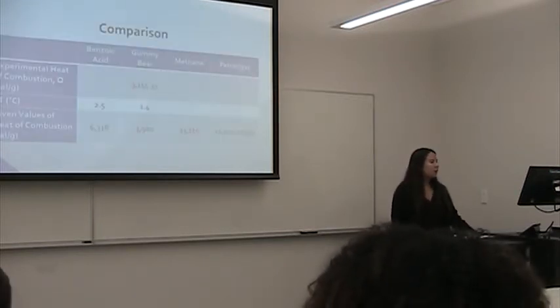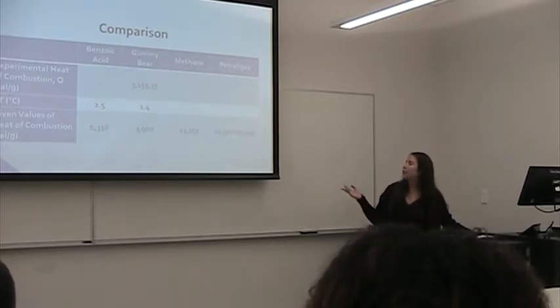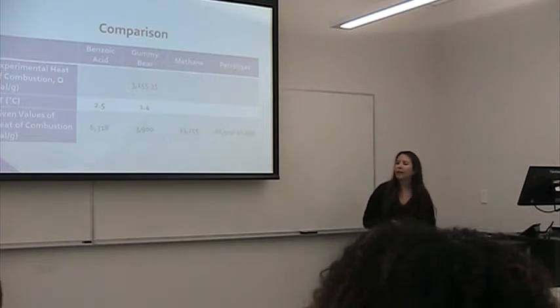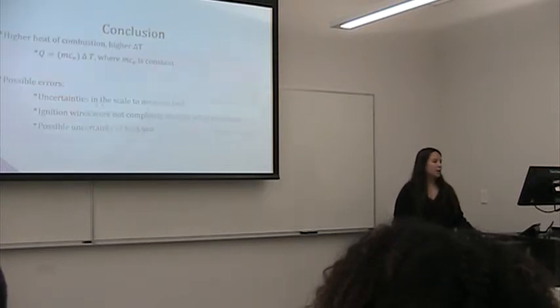This is a comparison. I also searched for different fuels, methane, petrol, and gas, and they have higher heat of combustion values than the gummy bear and the benzoic acid. And the benzoic acid has a higher heat of combustion than the gummy bear. And that was the whole experiment.